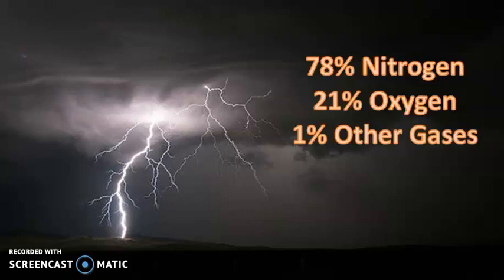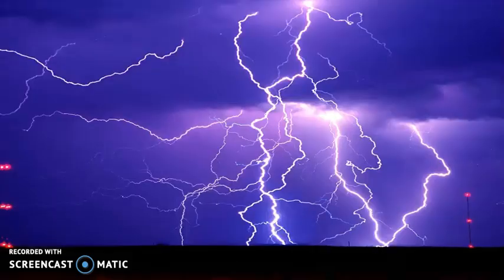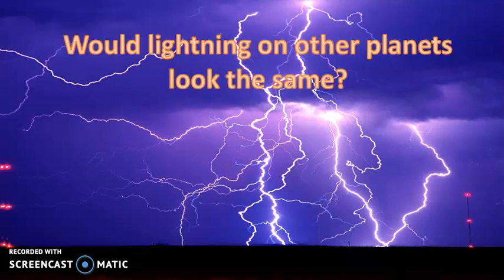Now, I want you also to remember that the atmosphere is made of 78% nitrogen, 21% oxygen, and 1% other gases. So when you're seeing lightning, why does lightning look so bright? You can probably use your previous observations to now explain why. Or why, when we see lightning during a storm, when it's actively raining, why do we see it being purple in tone? Because oftentimes it can be interpreted as purple. I'm going to ask you yet another question, which you're going to respond to in your lab notebook. Would lightning on other planets look the same as it does here on Earth?